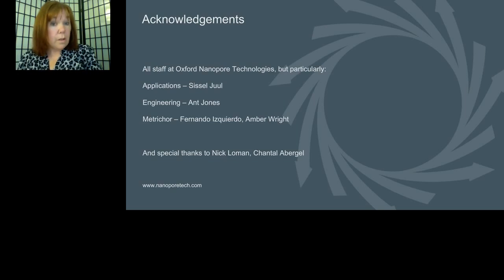Thank you. We do have another question. Our audience member asks, I noticed that in the moonshine results from WIMP, reads from cow also appeared, but you said the WIMP workflow was for bacteria or virus only. Does that mean I can customize the WIMP database?